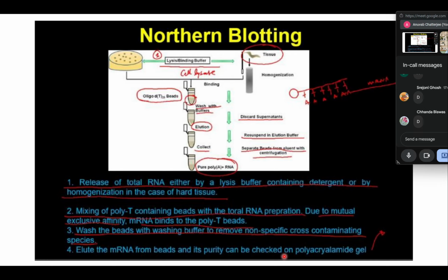So here, once our mRNA is bound to the column, you can wash using the wash buffer. The wash buffer is majorly made out of ethanol. Again, for the same idea that if you have anything that is non-specifically binding to the column, which in this case can be salts, even when a lot of ethanol is passed through, they will still remain dissolved in solution.